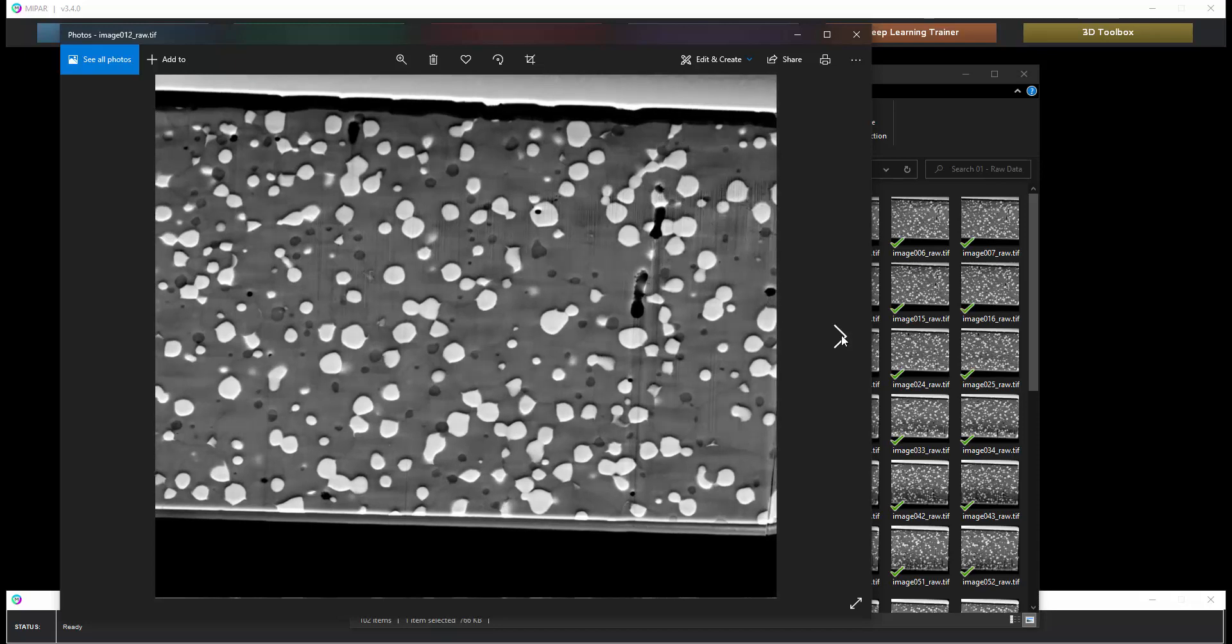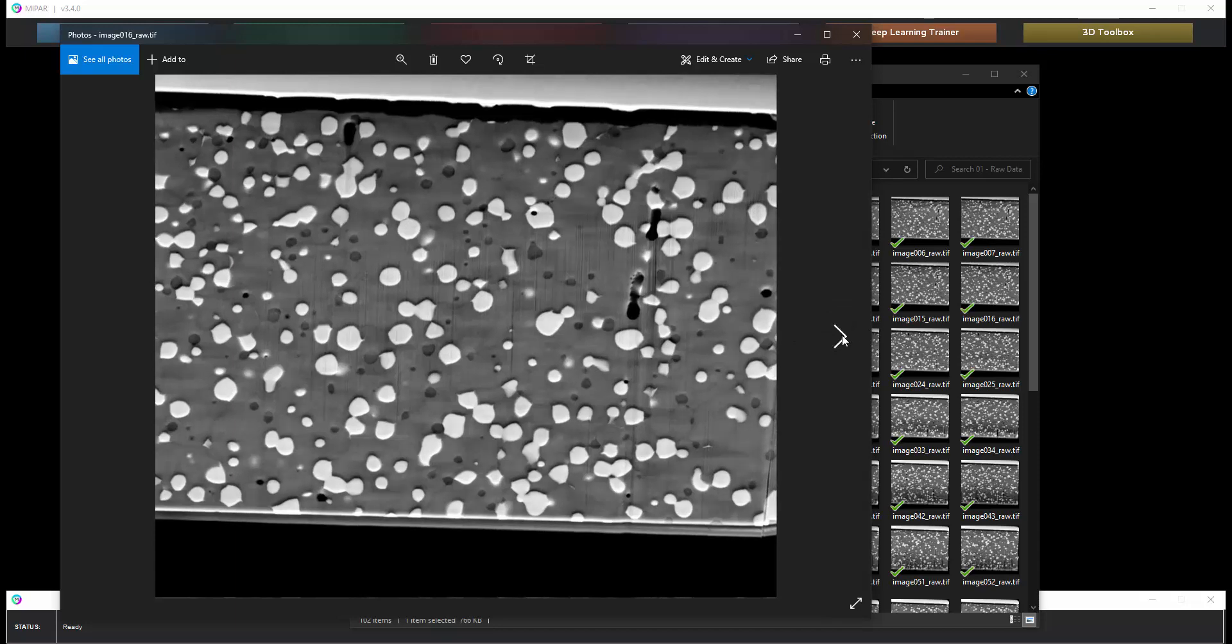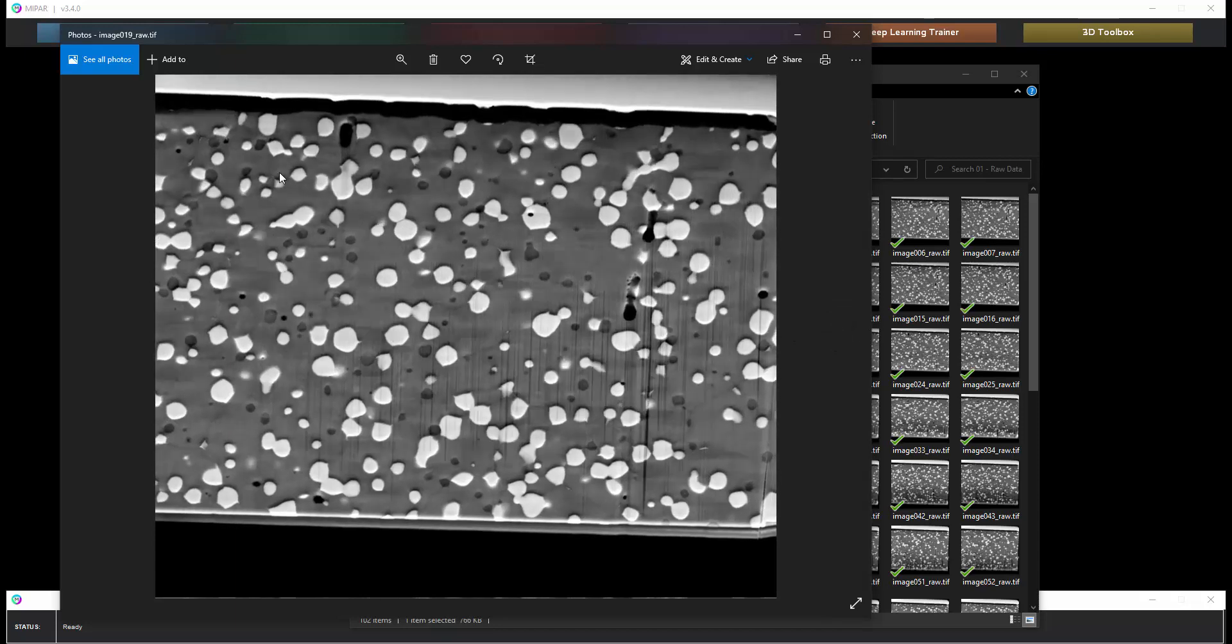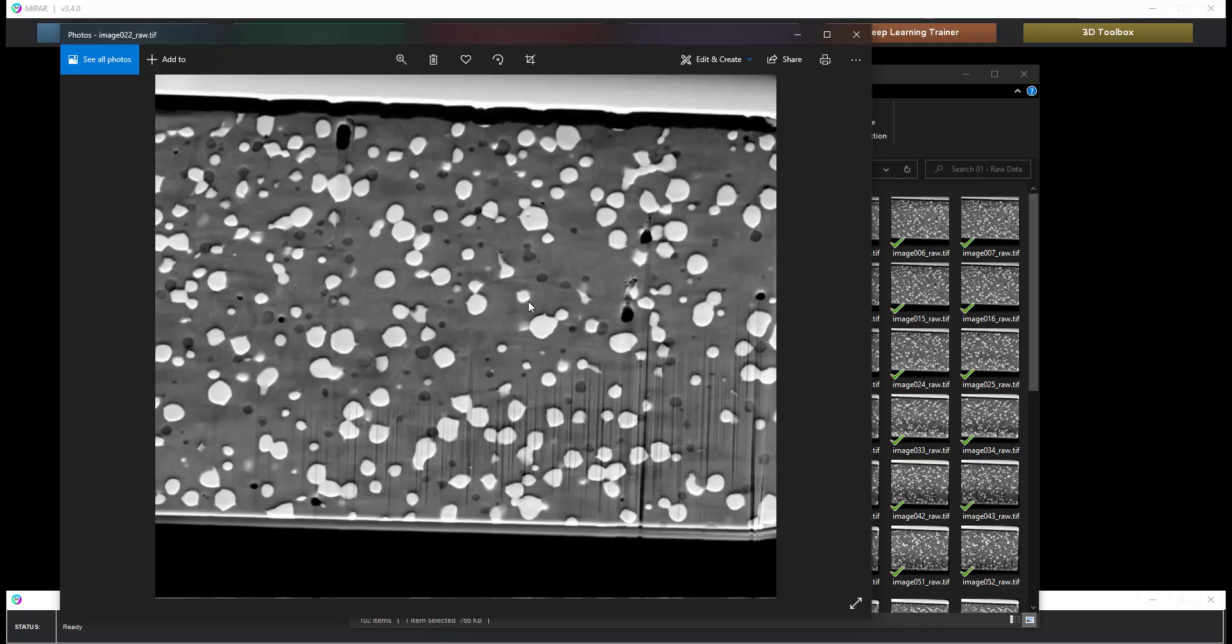We can see there is some drift in the images that needs to be corrected as well as an area of interest that we need to crop in on. So we're going to break this up into two stages. The first is going to involve the alignment and cropping of the data set and once that is done then we will apply the recipe to those images to create our full volume reconstruction so that we can visualize and measure the 3D microstructure.